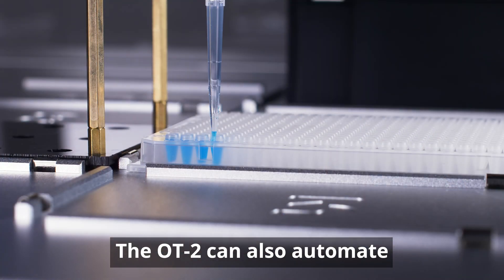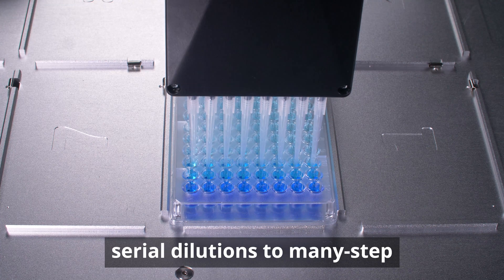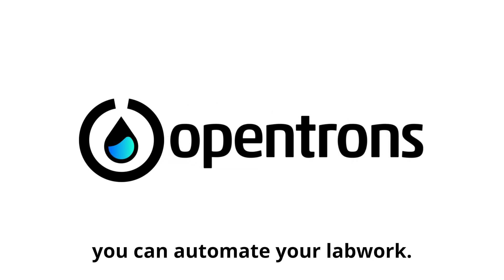The OT2 can also automate many other common life science protocols, ranging from simple serial dilutions to many-step library preps. Contact us to learn more about how you can automate your lab work.